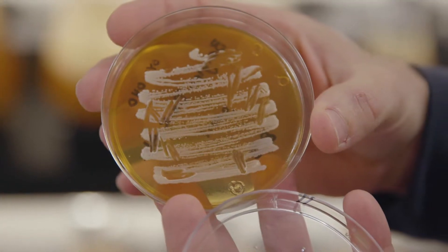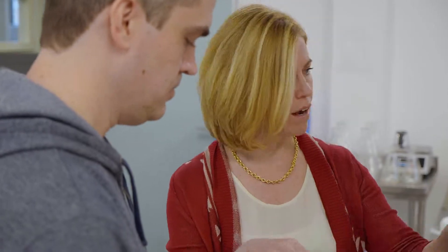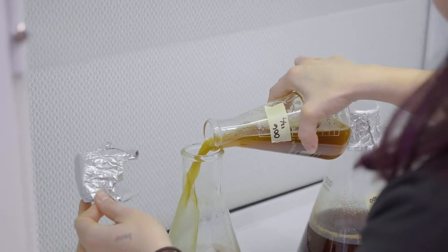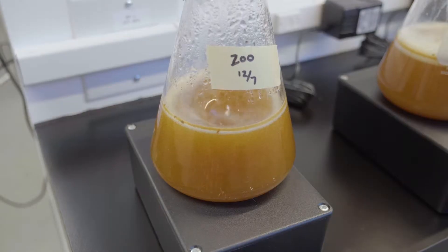Well over a million cells in one of those dots. One cell becomes two, becomes four, becomes eight, becomes 16. And they can double every hour and a half, so you're getting exponential growth. So from here, do you kind of scrape all of that off and put it in one of these flasks? We do an aseptic transfer to make sure that we're only transferring the microbes we want. We'll use a sterile loop to scrape cells off of this plate and swizzle it into a flask, and that starts the whole process.